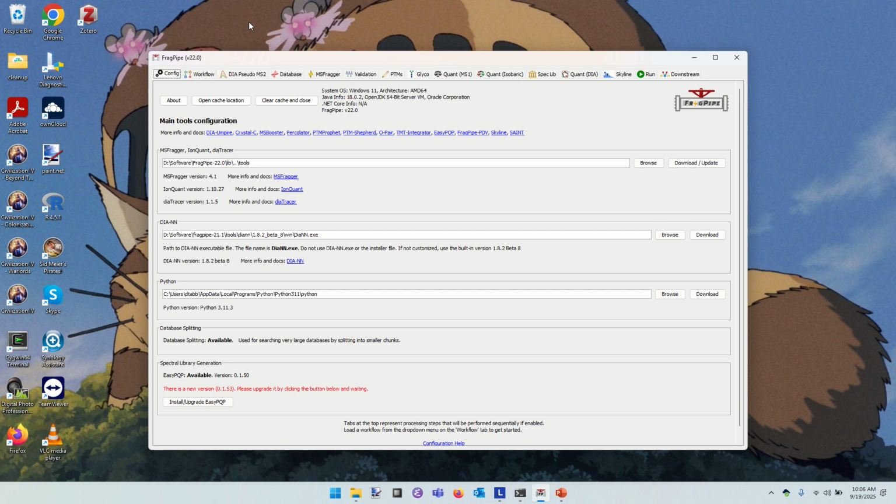Okay, so I will not start with slides because I really feel like with 2 hours we need to emphasize doing rather than talking. But I'll start by saying that a tandem mass spectrum, or an MS-MS, is the death cry of a peptide. I know that's a silly way to put it, but when a peptide is isolated, it can then be given a little voltage to cause it to move about more aggressively.